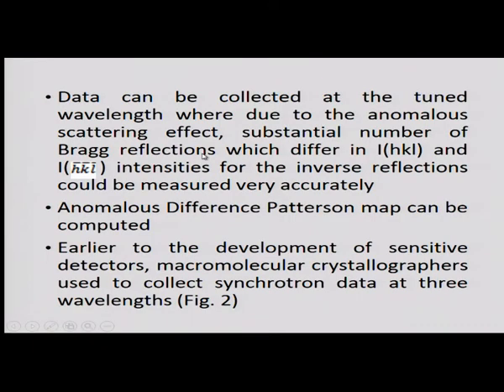So, now in all the synchrotron radiation facilities throughout the globe, one beam line is already tuned to the selenium absorption frequency. So, data can be collected at the tuned wavelength, where due to the anomalous scattering effect, a substantial number of Bragg reflections, which differ in intensities of HKL and intensity of H bar, K bar, L bar reflections, called the inverse reflection, could be measured very accurately.